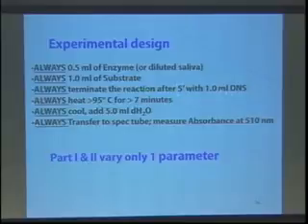Let the reaction proceed for 5 minutes. You stop it by adding DNS. We have at the benches a dispenser that's preset to 1 ml of DNS. You lift it up and down. It's done. It stopped the reaction. It's very alkaline, about pH 14. Any amylase that is in that tube is instantly denatured to lose activity.